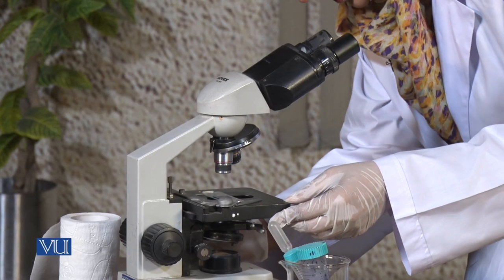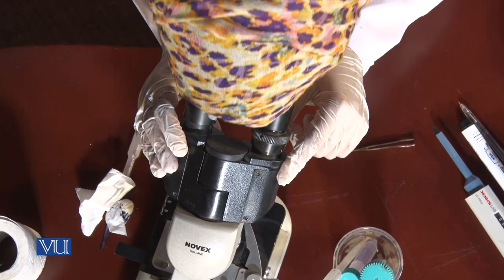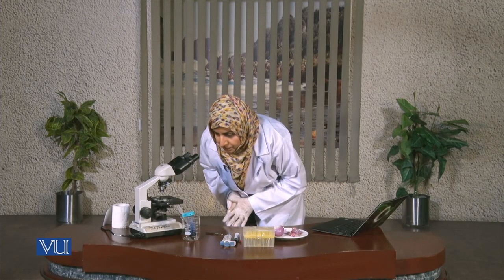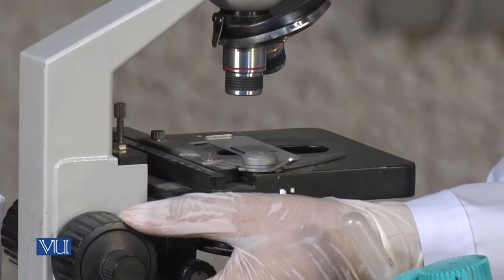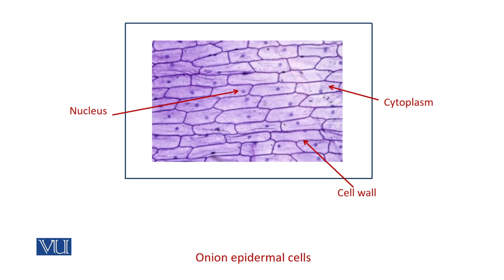We can now adjust it and view it under the 10x objective lens. What we can see here is the darkly stained nucleus, which is found on the periphery of the cell. The cell wall is very distinct and has a specific shape. The cells are looking like bricks and they are tightly packed with each other. We can see the lightly stained cytoplasm — these are all the features of a plant cell.